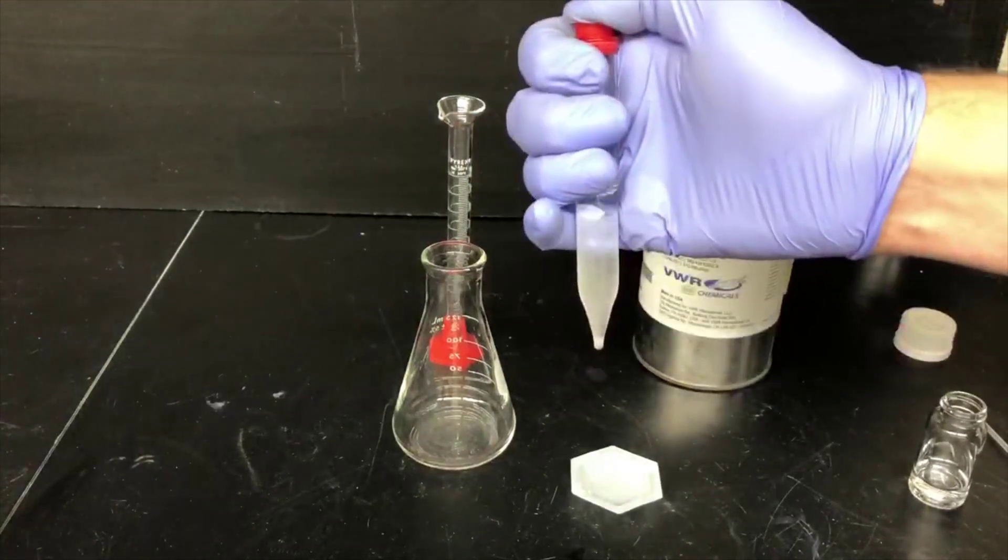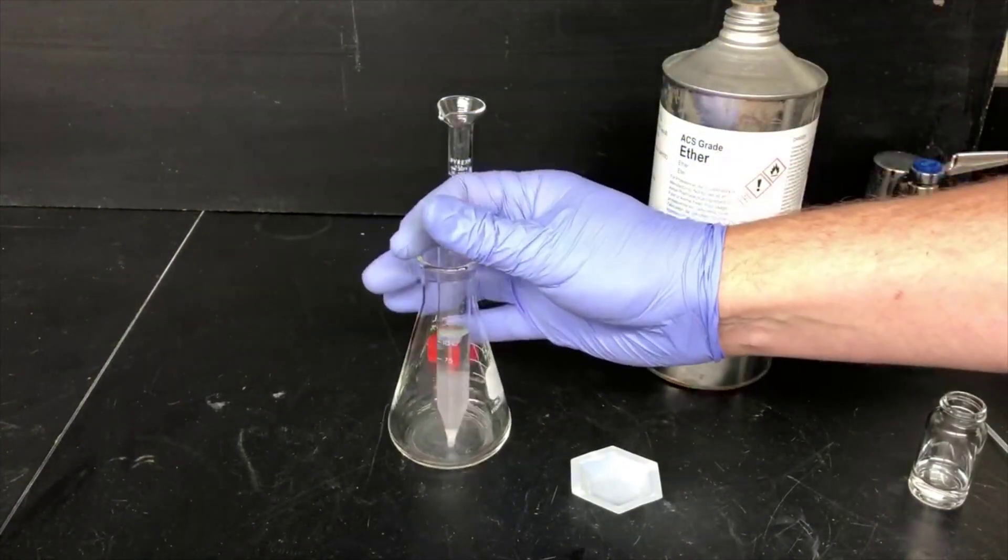We now have two layers, a salty water layer and an organic layer that contains mostly ether but also cyclohexanone.